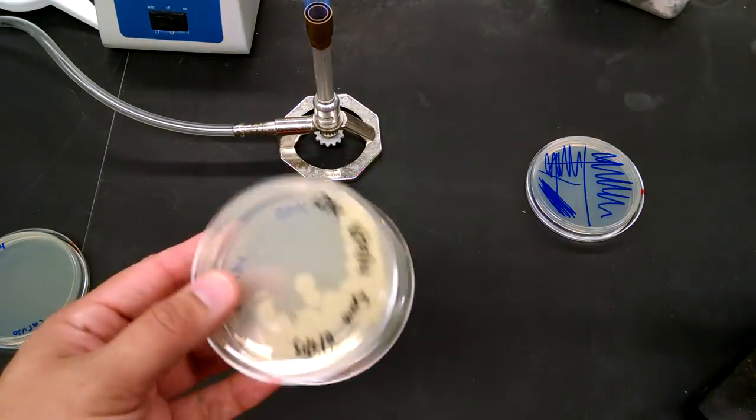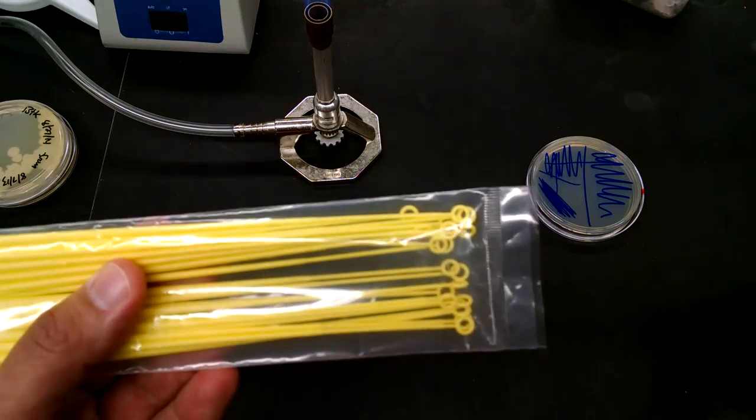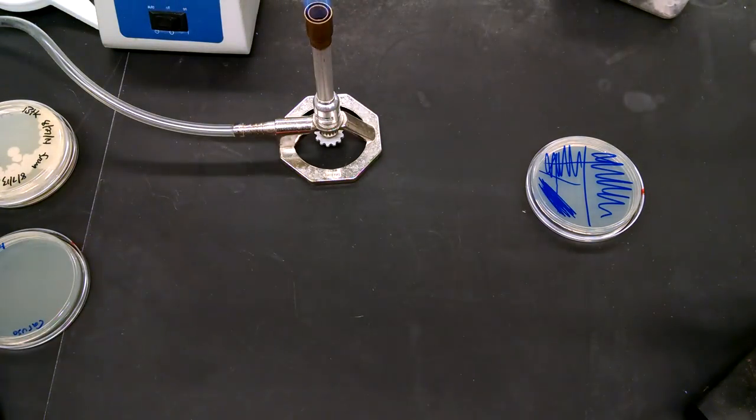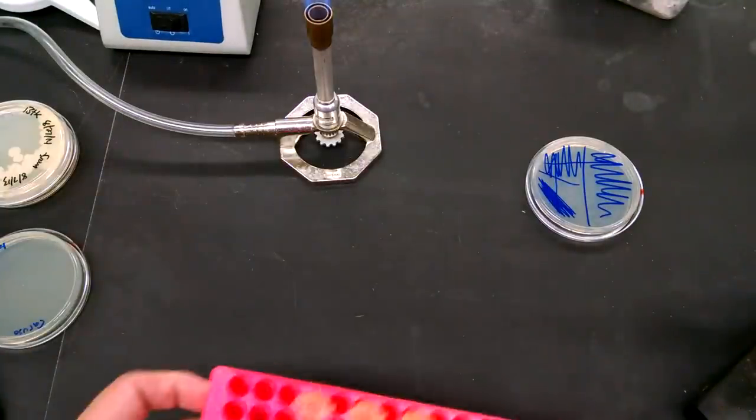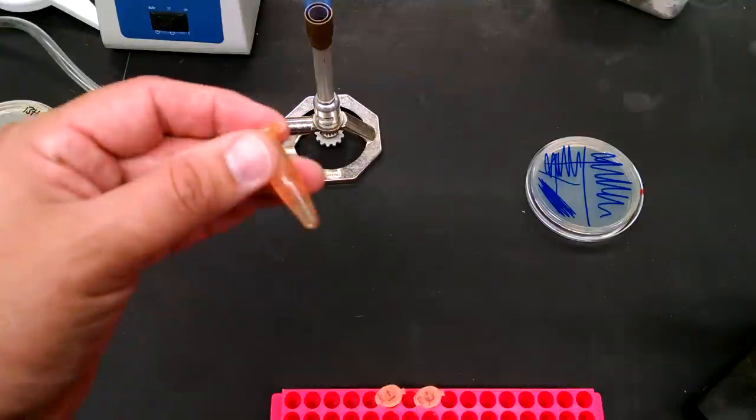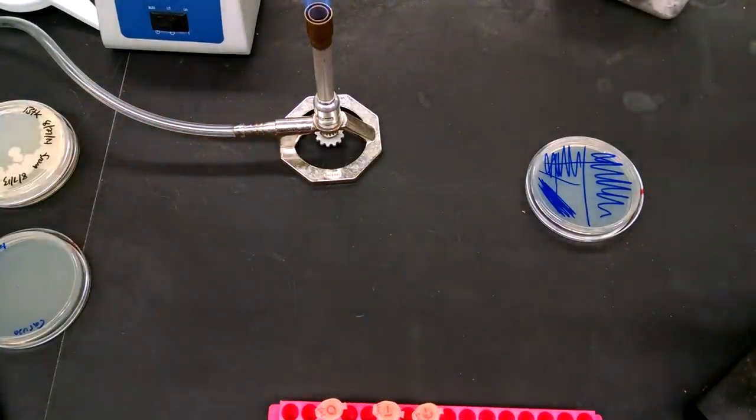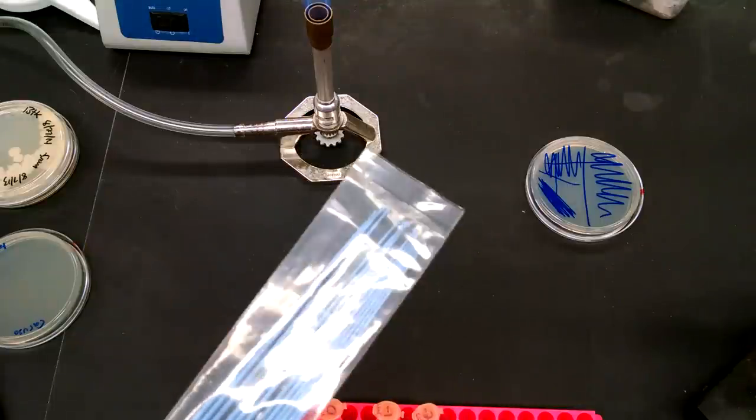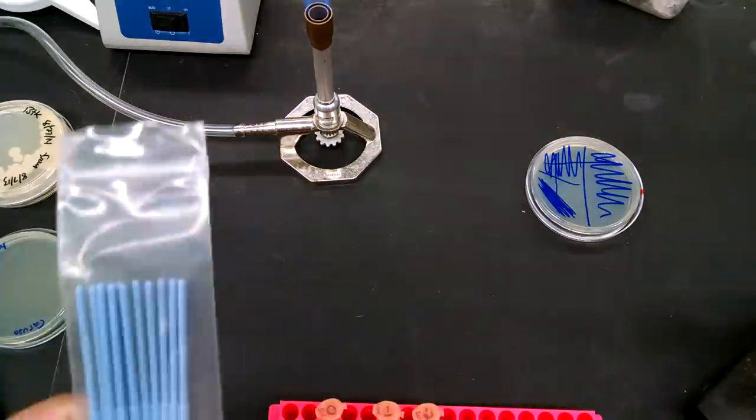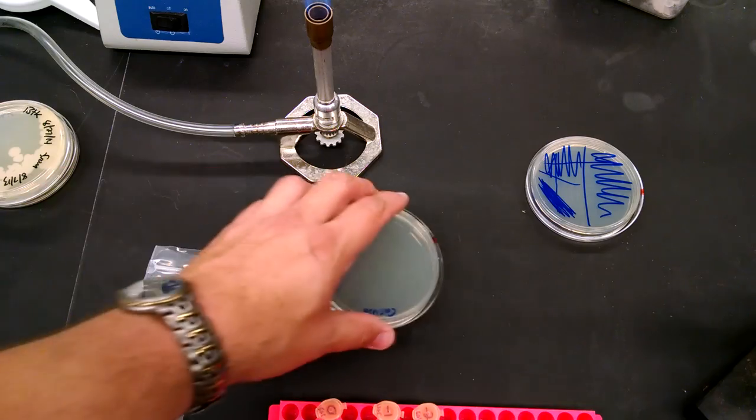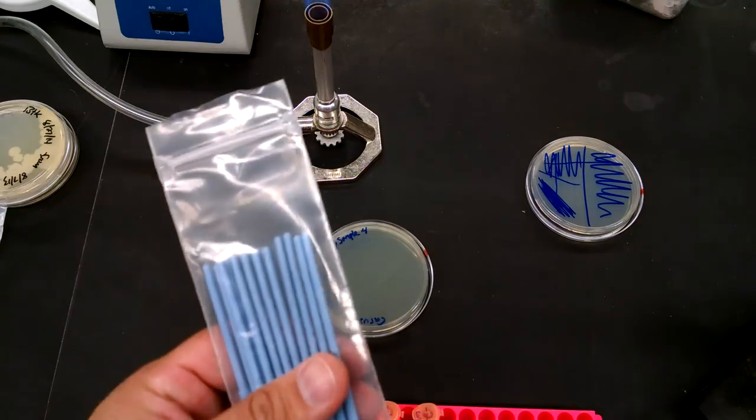But sometimes, especially in the Phage Hunters lab, you're going to need to streak from liquids. And then you can use these if you have a lot of liquids, say maybe you're streaking from a tube like this. Or sometimes you may be streaking from a tube like this where you can't get very far into the tube or it's way down in there. Then we have smaller loops that you can use. When you're doing your initial tests and you only have 100 microliters in the tube, these yellow loops don't reach all the way down to the bottom. We have these blue loops.